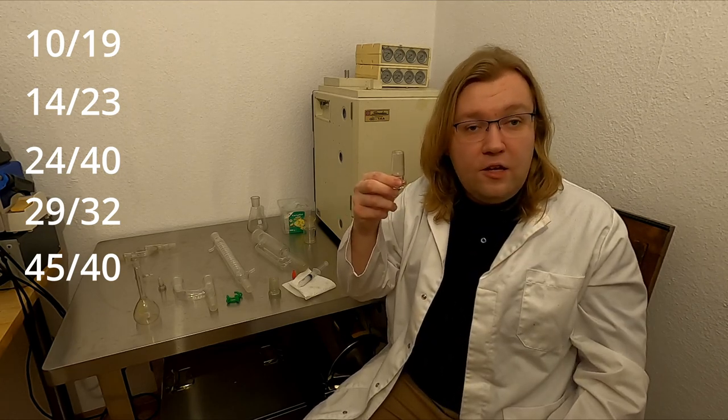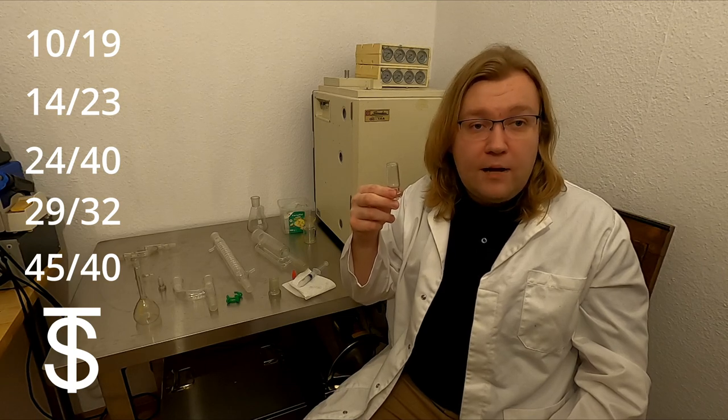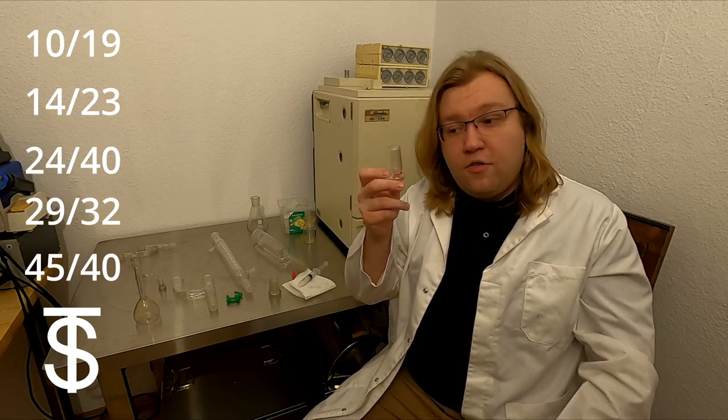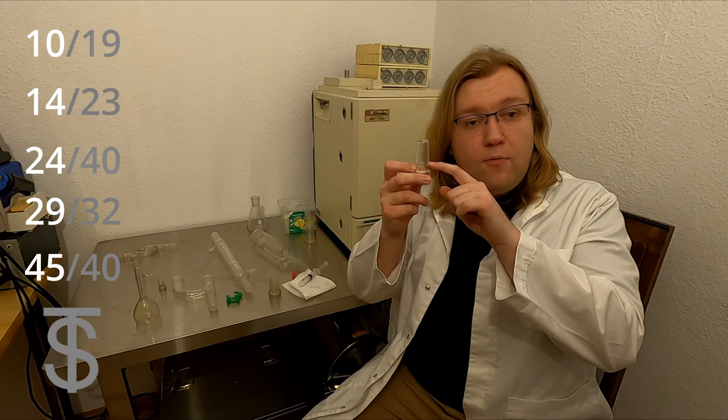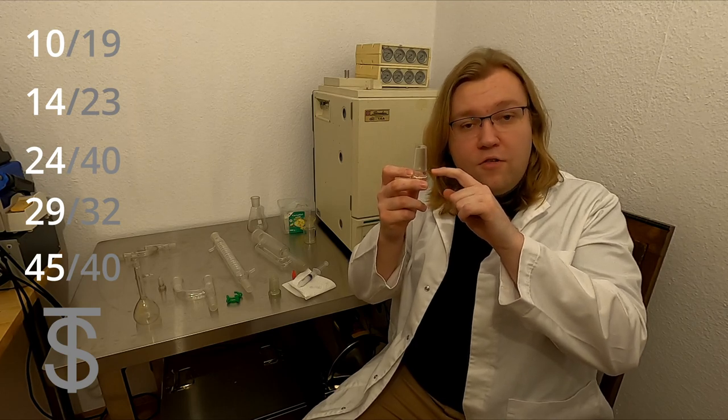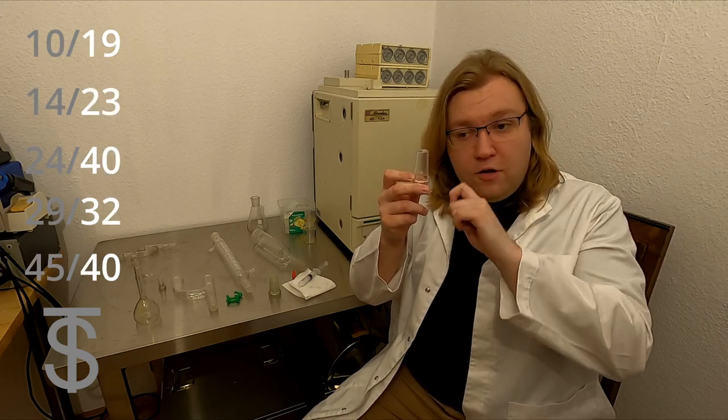These joints have a standardized taper angle, denoted by the letters ST. They are usually declared by two numbers. The first number being the width of the widest part of the joint, the second number being the length of the joint.